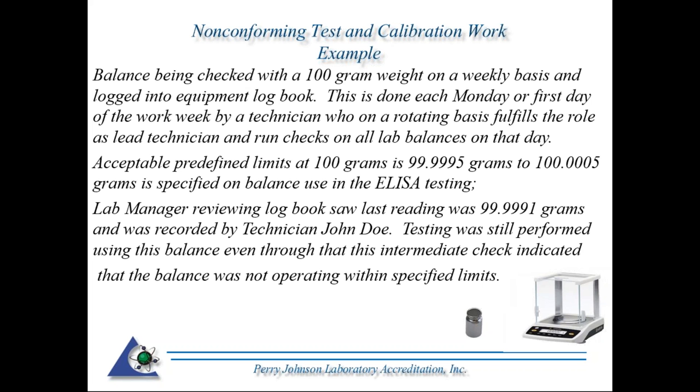So the example I have is this situation, a scenario where we have an analytical balance being checked with a 100 gram weight on a weekly basis and logged into an equipment logbook. This is done each Monday, the first day of the work week, by a technician who on a rotating basis fulfills the role of lead technician and runs checks on all lab balances on that day. Hence, this particular organization has a protocol for intermediate checks of their analytical balance.